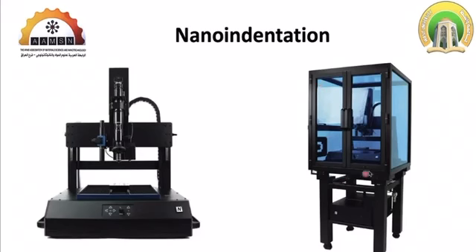The box and the vibration table are used to eliminate all the effects of the environment, the thermal effect of the environment, vibration in the building, and so on. So putting the nanoindentation inside a box is crucial, and you can't rely on any test without doing so.